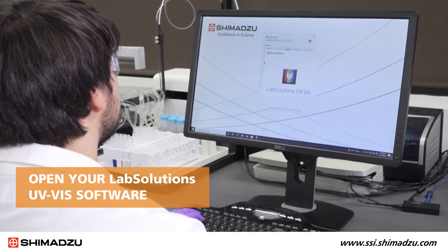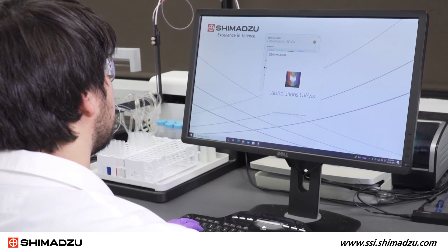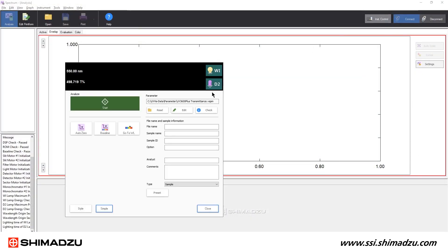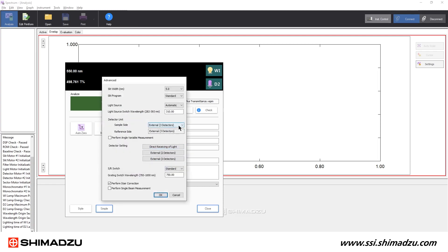Now you can open your Lab Solutions UV-Vis software to ensure the proper settings are selected for the integrating sphere. Click Instrument Control, then click Edit to modify the parameters. Select Advanced, and then the External 3-Detector option.